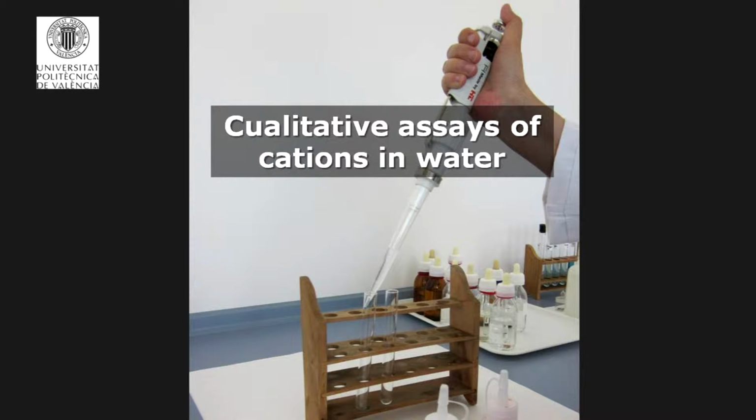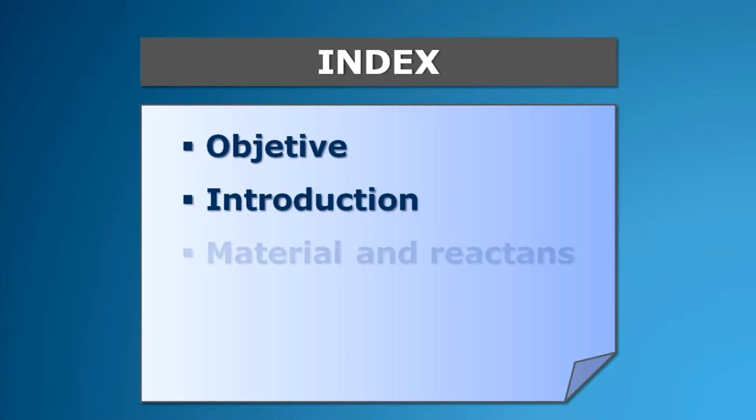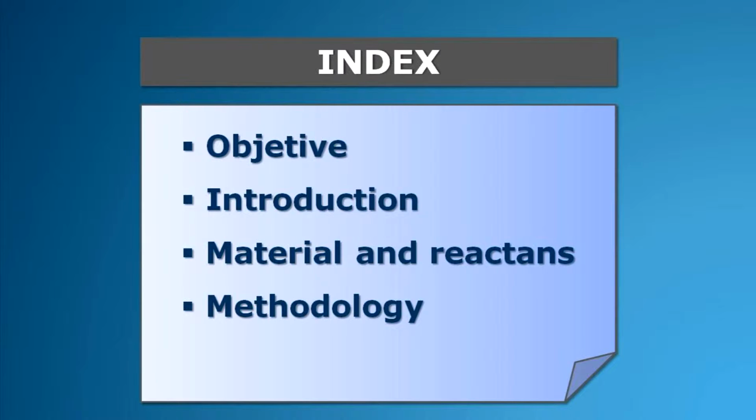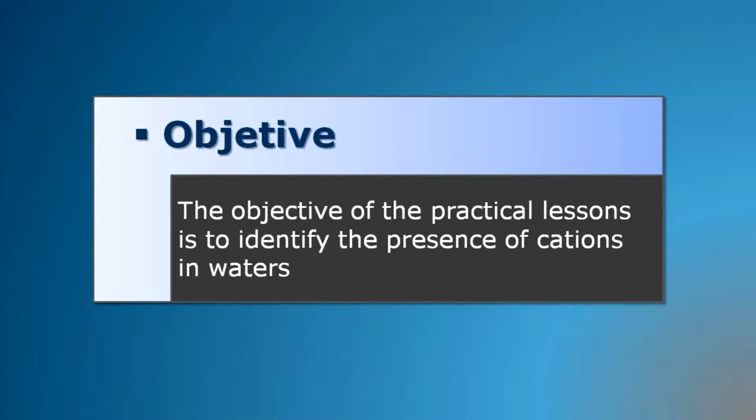Qualitative assays of cations in water. Objective. Introduction. Materials and reactants. Methodology. Results. The objective of the practical lesson is to identify the presence of cations in water samples.